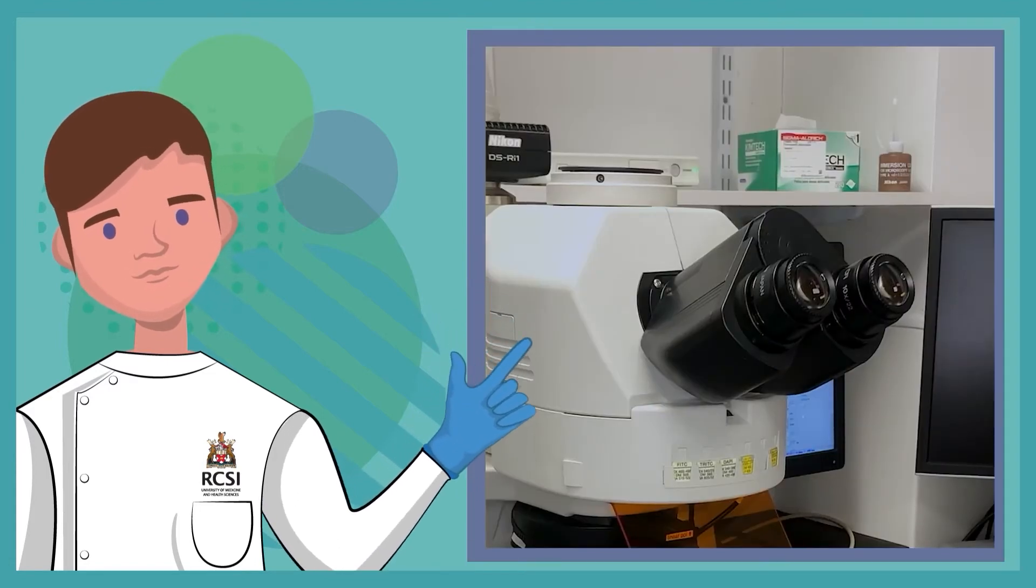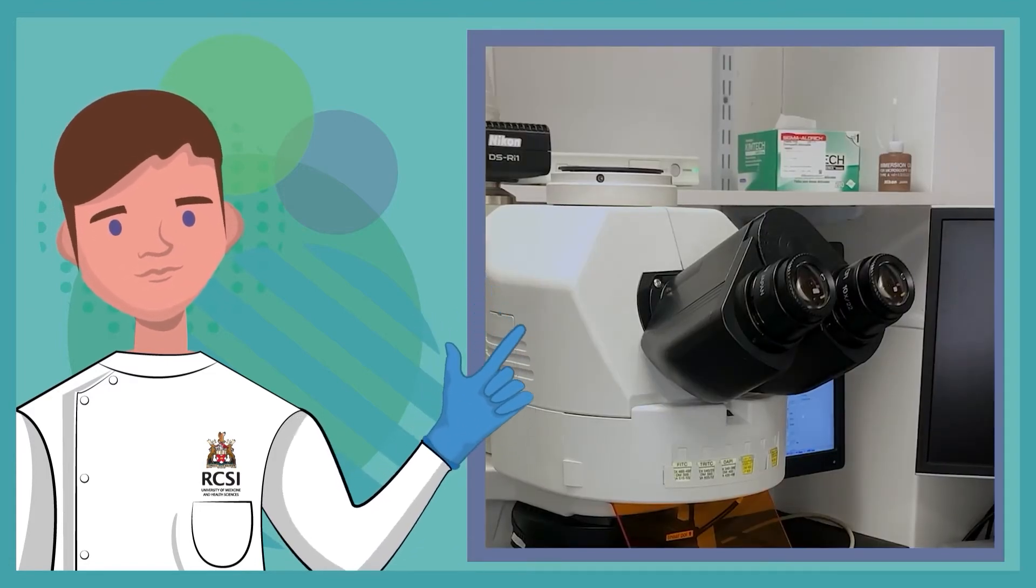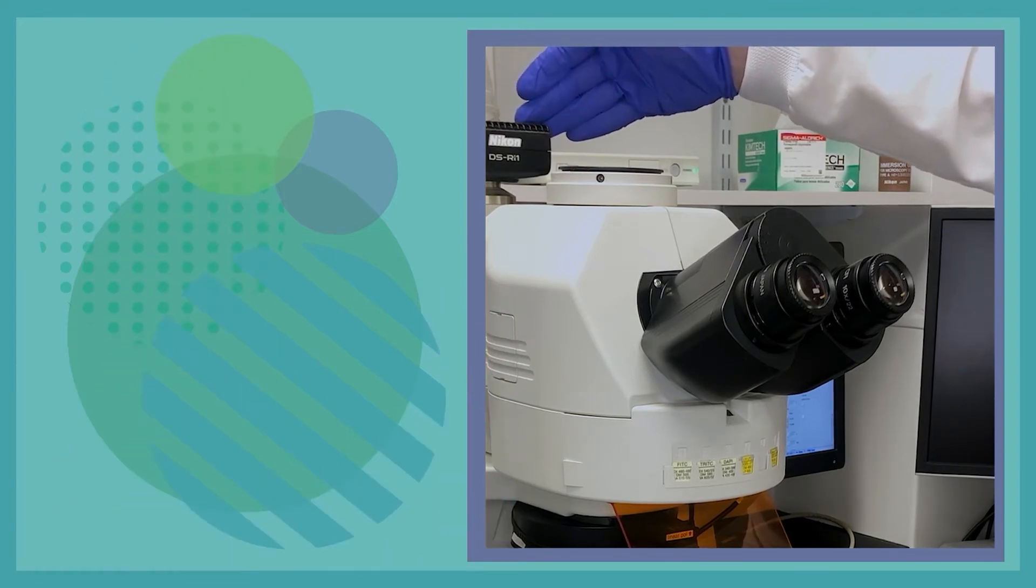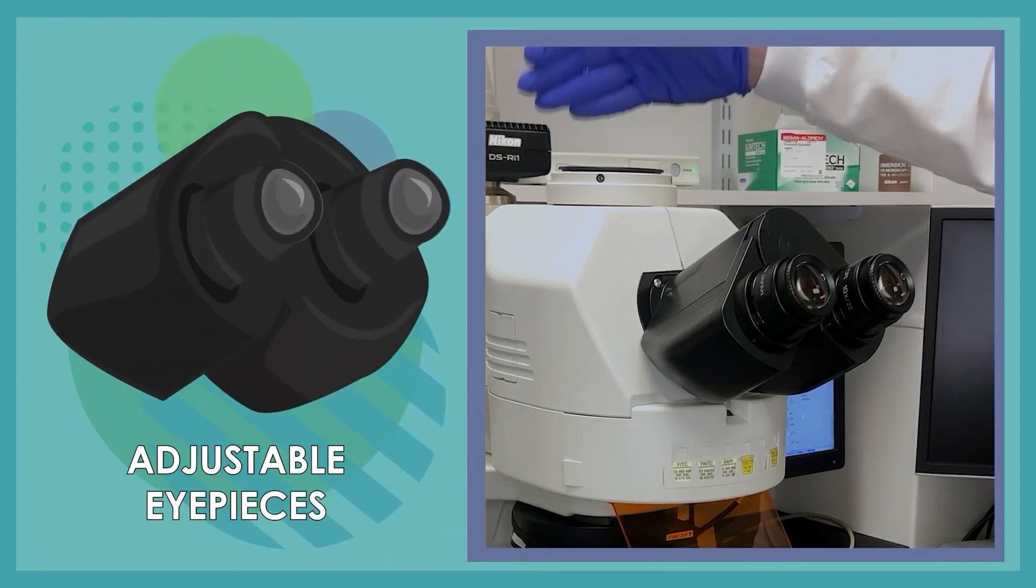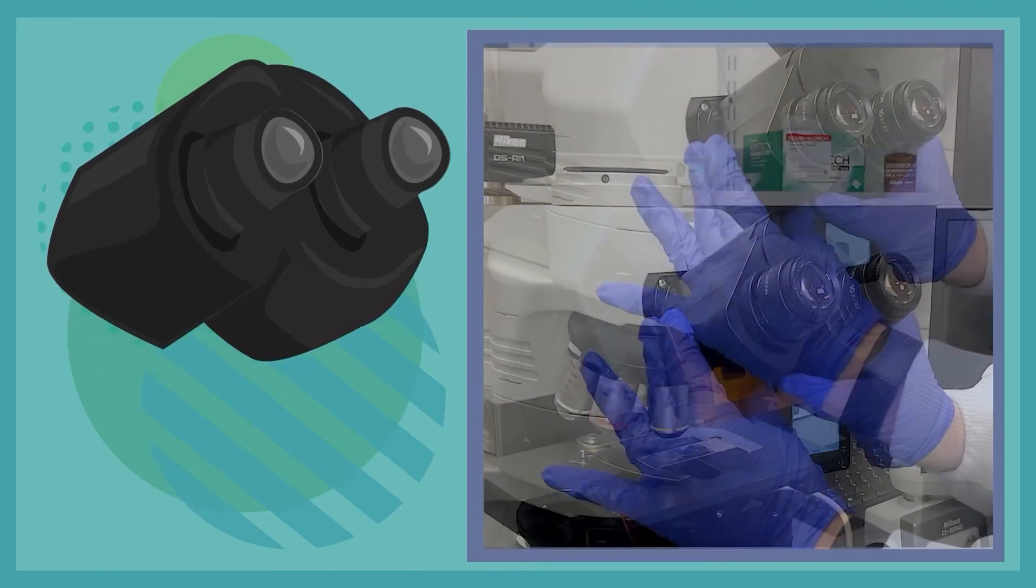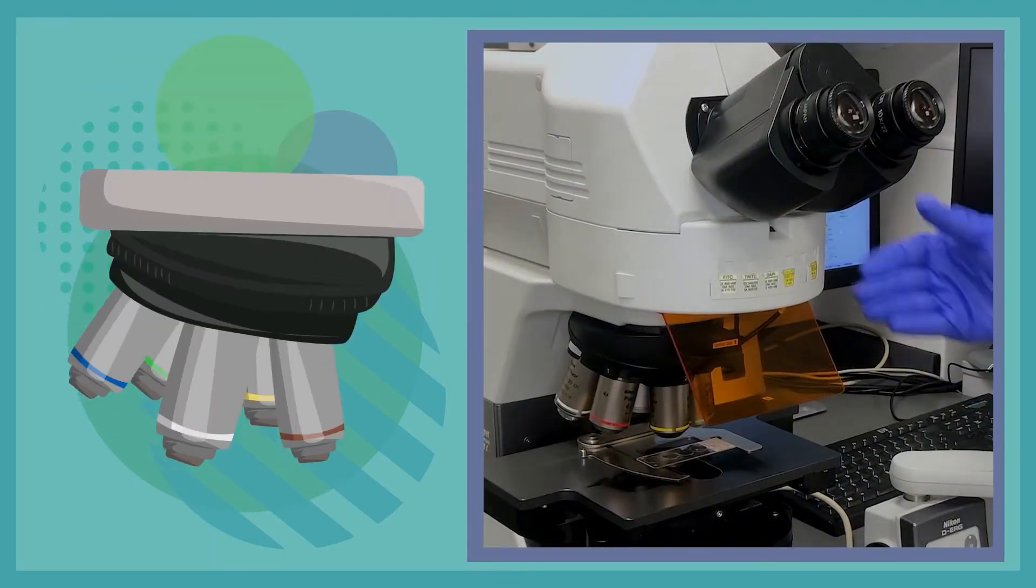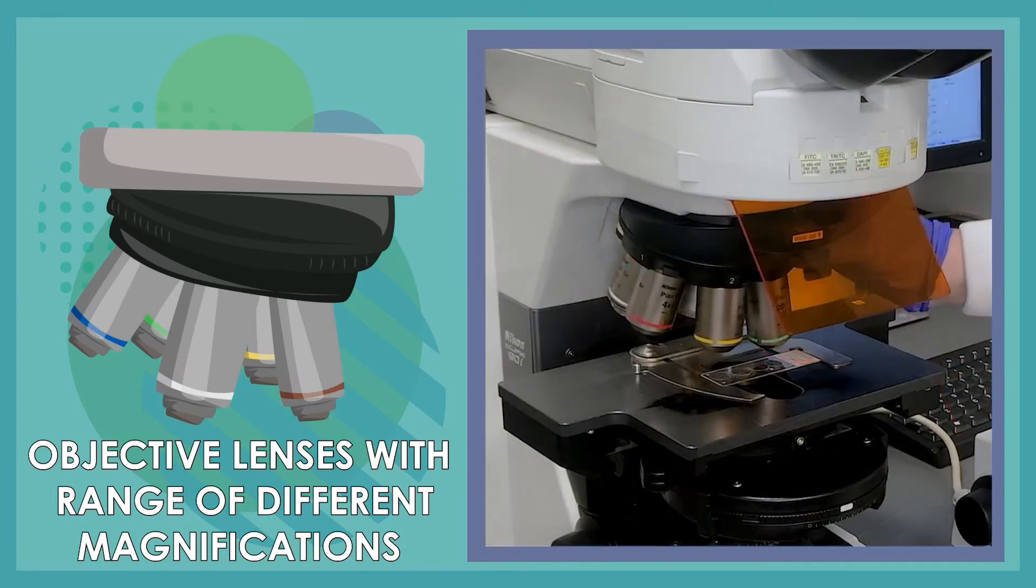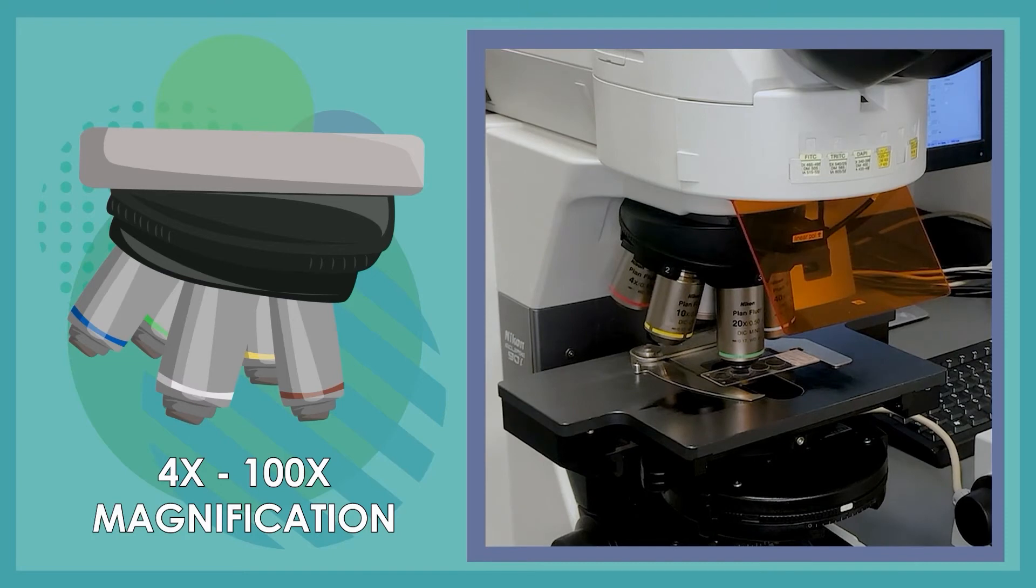Now looking at the individual components of the microscope, we'll work from top to bottom. First we'll look at the individual objective eyepieces. These can be adjusted for each user to visualize their sample. Next we have the objective lenses which come in a range of different magnifications. These magnifications can range from anywhere between 4x and 100x magnification.